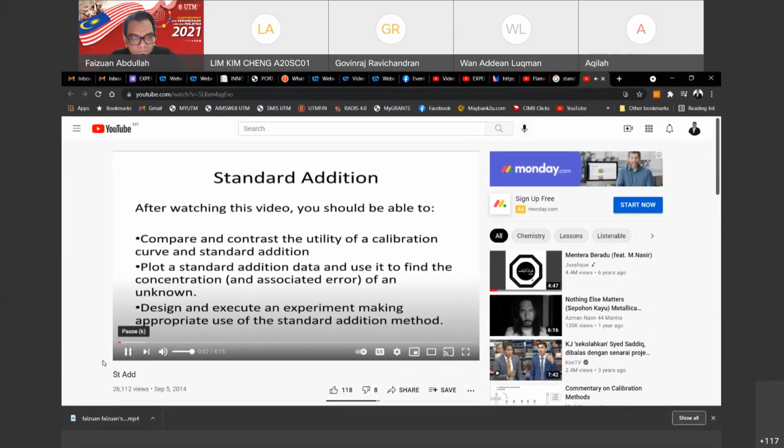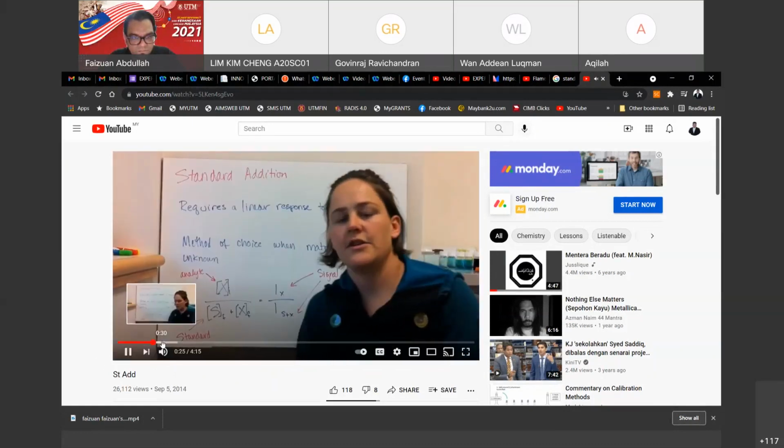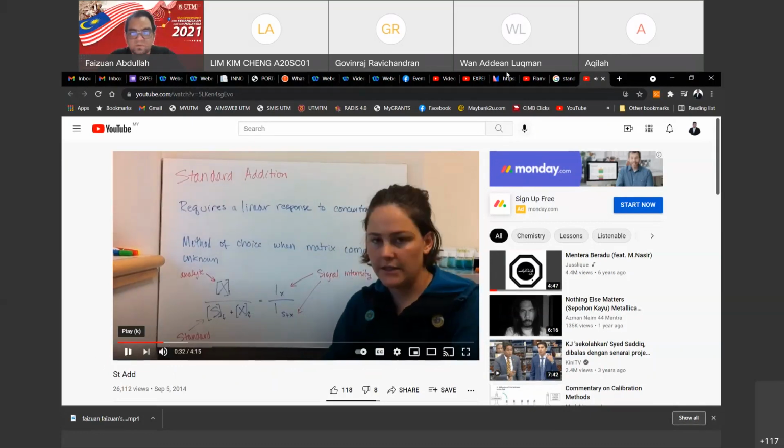In this video on the standard addition method, you should be able to compare and contrast the utility of using a calibration curve method, the concentration, and also design. Standard addition is another method that's related.